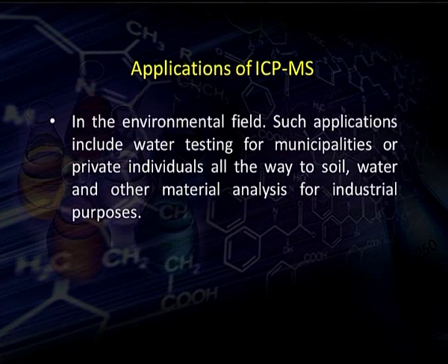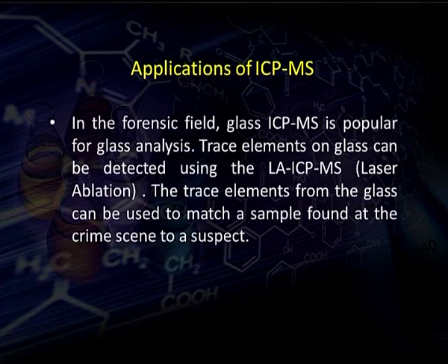In the environmental field, the ICP-MS finds its application. Such applications include water testing for municipalities or private individuals, all the way to the soil, water and other material analysis for industrial purposes. In the forensic field, ICP-MS is popular for glass analysis.